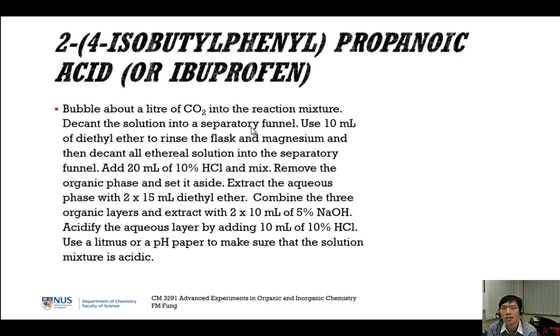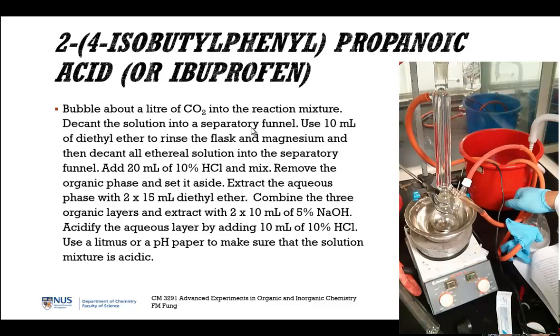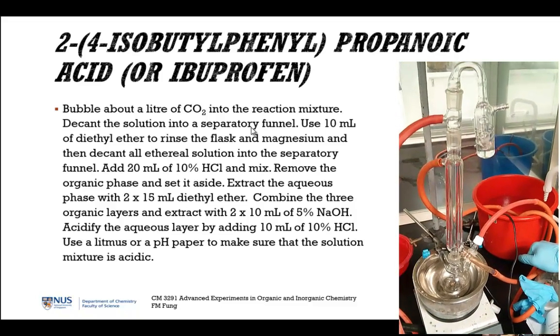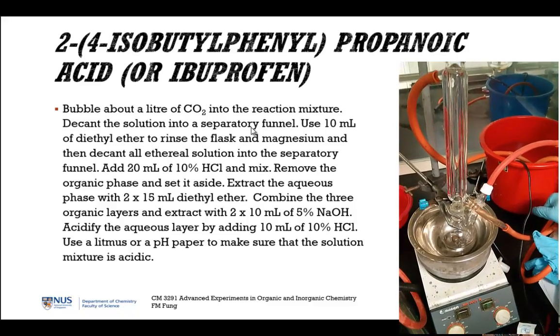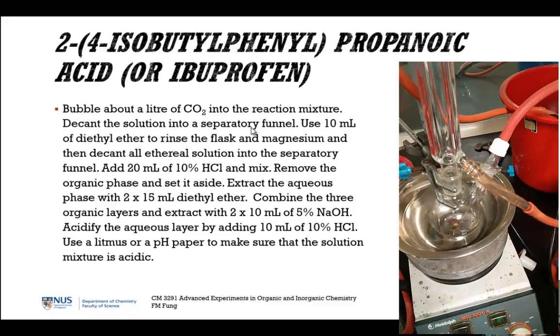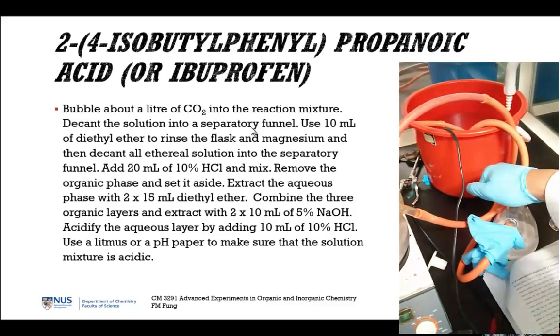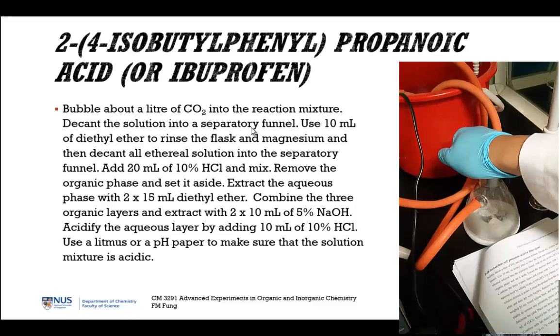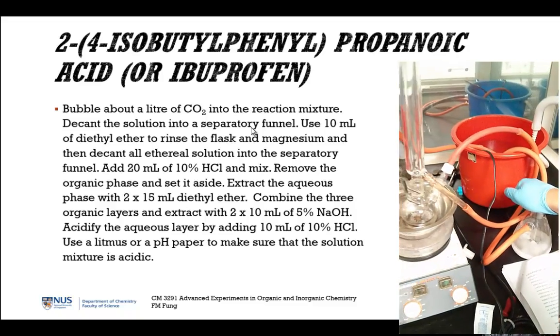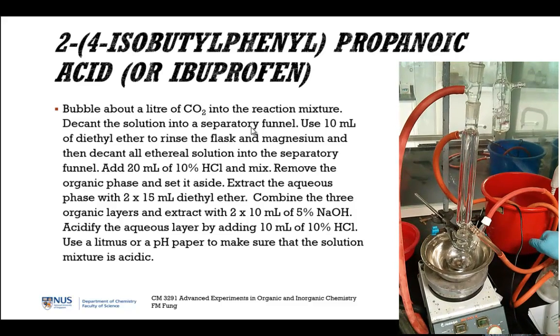You put some dry ice inside this Buchner funnel, okay, then the exit here, the side exit of the Buchner funnel, you use an orange tubing, okay, connect it to a plastic pipette, okay, make sure it's connected, no loose gap. Insert it into your Grignard reagent, and after that, make sure everything is clamped, okay, to your retort stand so that it doesn't topple. Then you add slowly some hexane into the Buchner funnel.